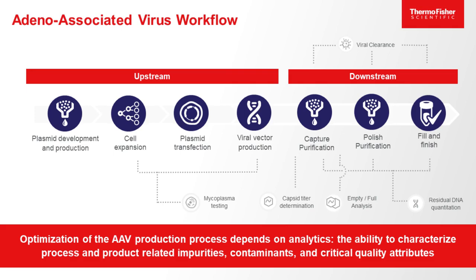In the downstream, purification process development scientists are increasingly focused on empty capsid removal and adventitious viral clearance, in addition to the standard host cell protein and DNA reduction requirements coming out of the regulatory agencies. And finally, release of an AAV product also includes meeting specifications for residual host cell DNA and plasmid, among others, which we'll touch on next.